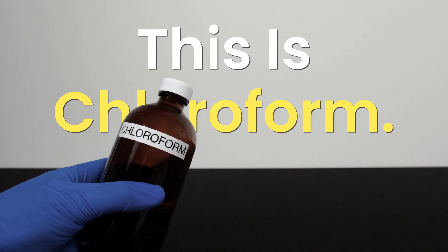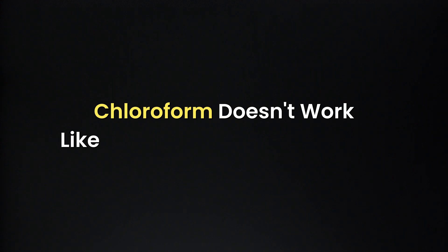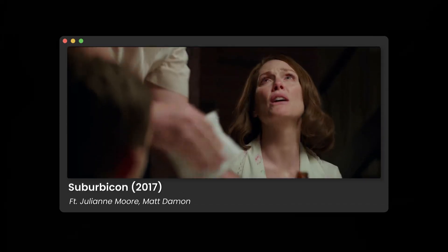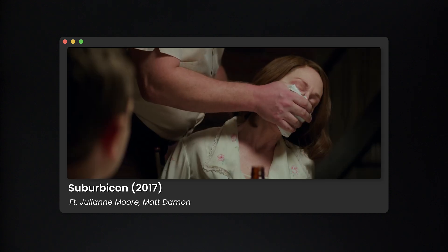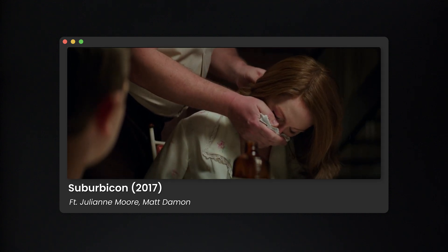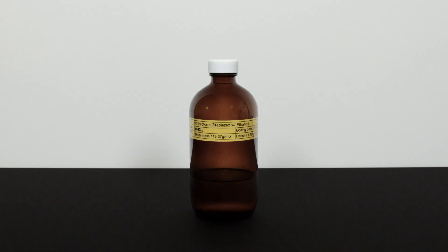This is Chloroform. And today, to all criminals watching this video, unfortunately, chloroform doesn't work like what you saw in the movies. Will chloroform make people unconscious? The answer is yes and no.